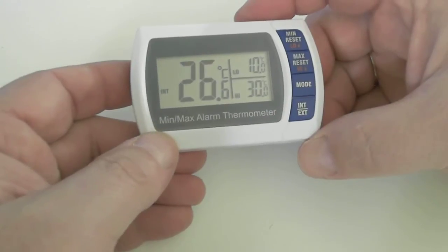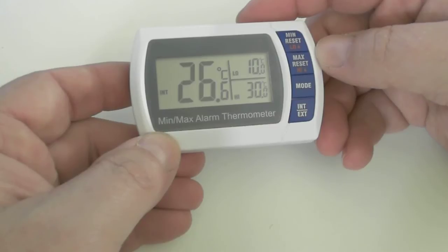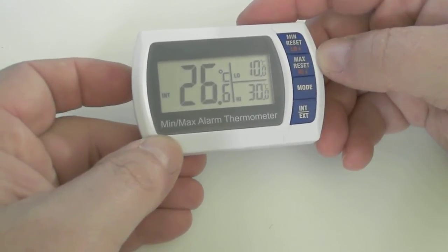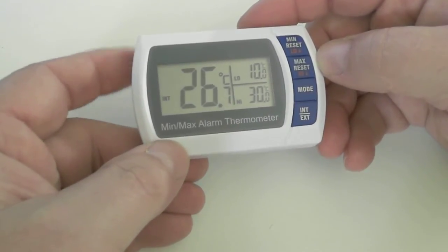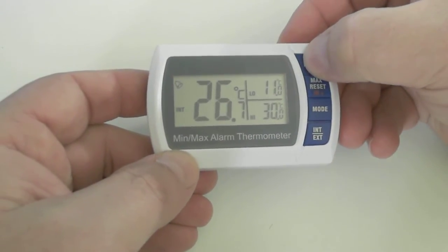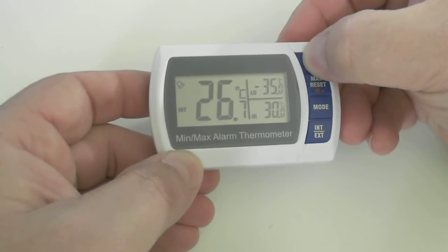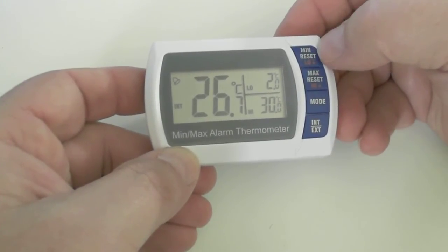Hit the mode button. That puts us into the alarm setting screen. Currently we have a low trigger point of 10 degrees and a high trigger point of 30 degrees C. So let's set this as we're going to measure vaccines, which usually have a two degree to eight degree temperature range. So let's set them — press the button. Holding it makes it go in five degree increments. It will go all the way up to 70 degrees Celsius, come back around to minus 50 degrees Celsius and go around, or minus 58 to 158 degrees Fahrenheit.